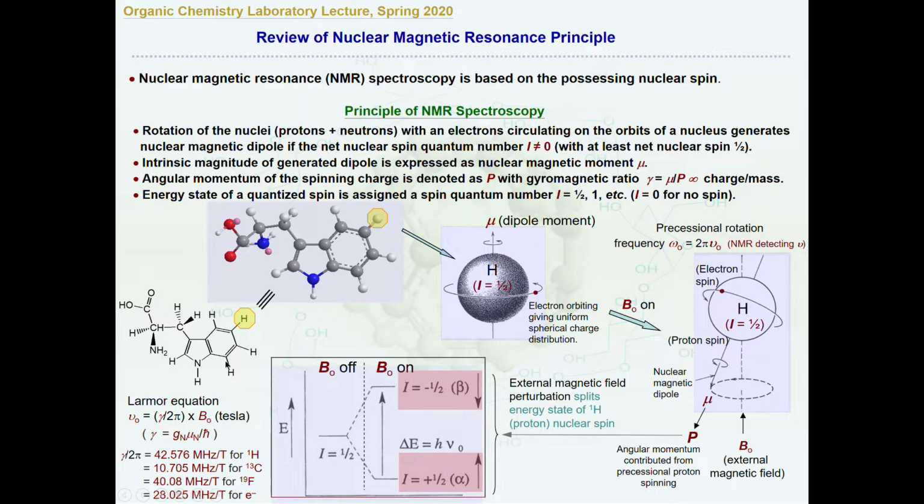If you take the compound and dissolve it in the chloroform-D solvent in the NMR tube, you see all the dissolved molecules. You cannot do a solid for the compound. It has to be fully dissolved to become a molecular measurement. So the molecule itself will tumble inside the solvent, right, moving around, and so there's no vector at all on each nucleus in here.